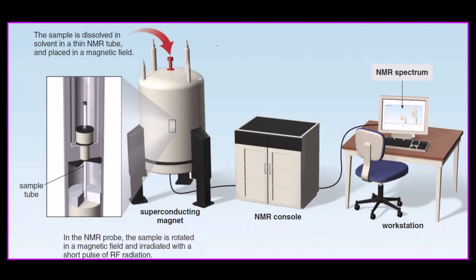There is a superconducting magnet. As we saw in the last video on the basic principles, we subject the sample to a magnetic field. And how do you provide the magnetic field? With the help of a superconducting magnet.